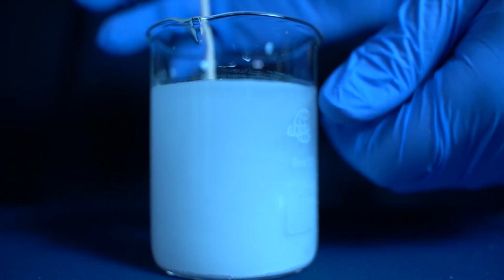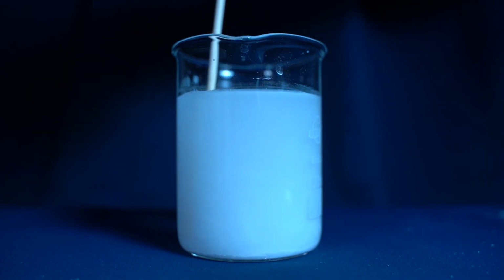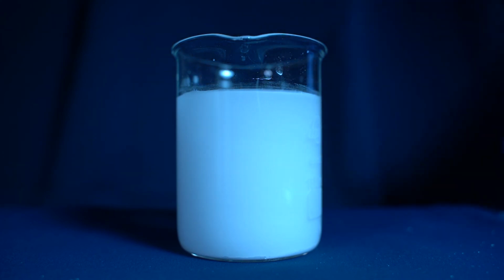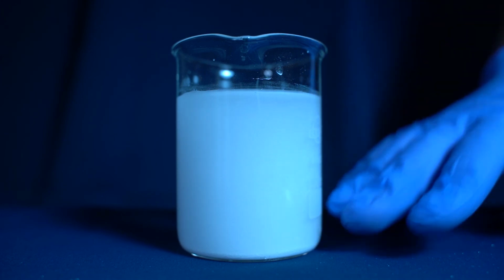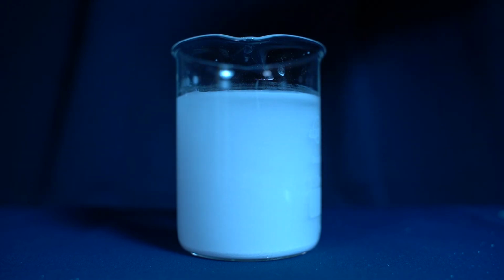Now I just want to clarify that it is not dissolving, but since I'm mixing it, it's being evenly distributed. But if I let this sit again for another day or two, all that precipitate will settle to the bottom because it will not dissolve in the water. And that's what a precipitate is.